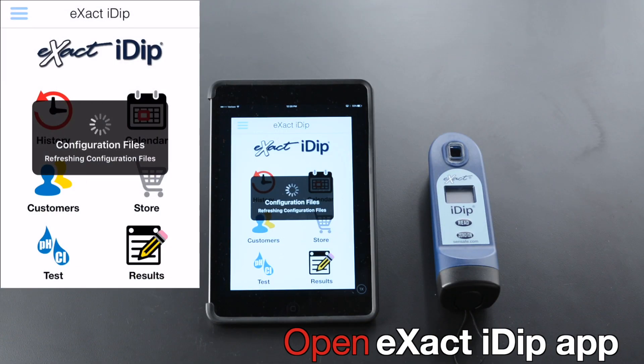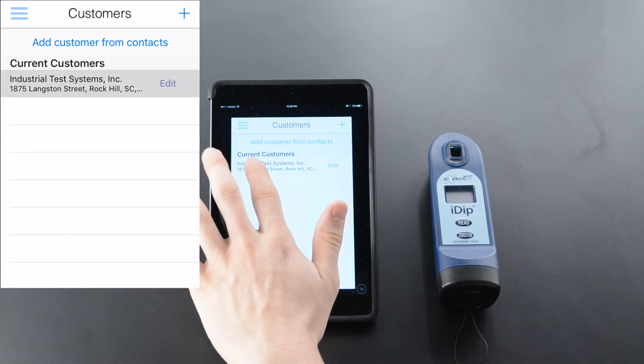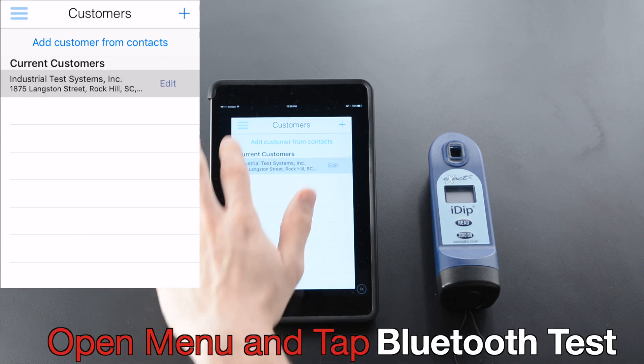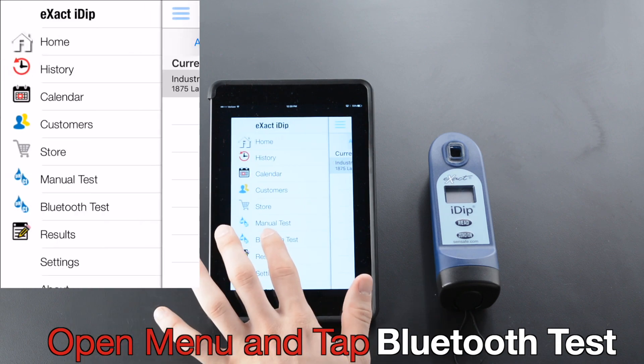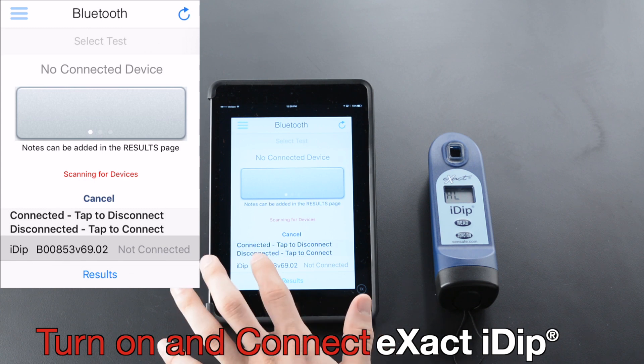Open the XactiDip app. Tap Customers. Select Customer, open Menu, and tap Bluetooth Test. Turn on and connect XactiDip.